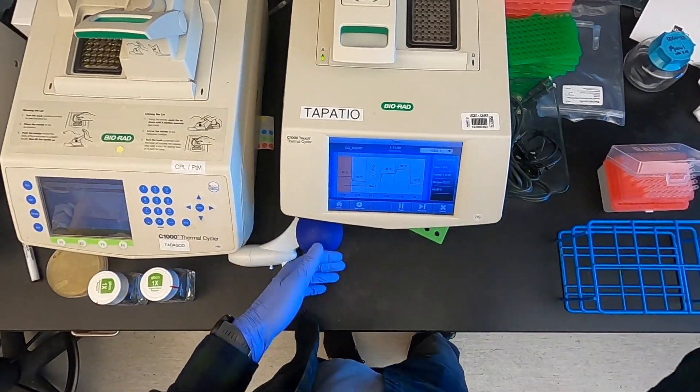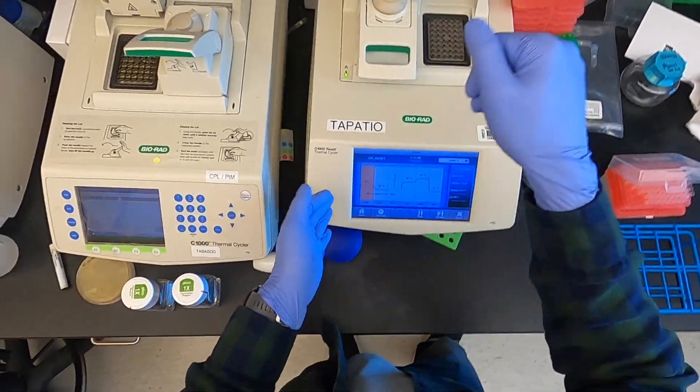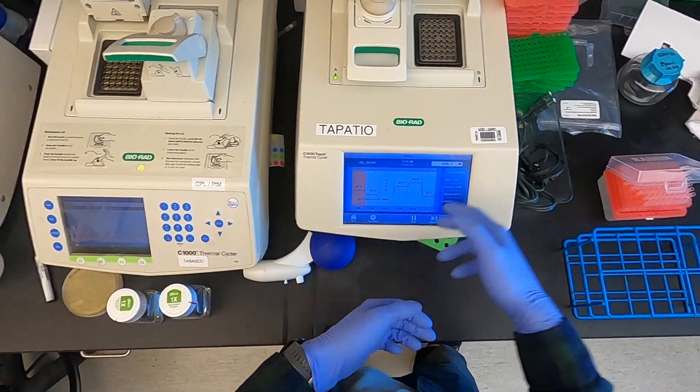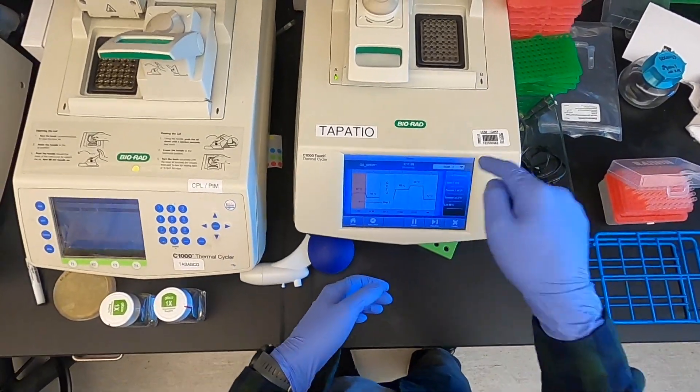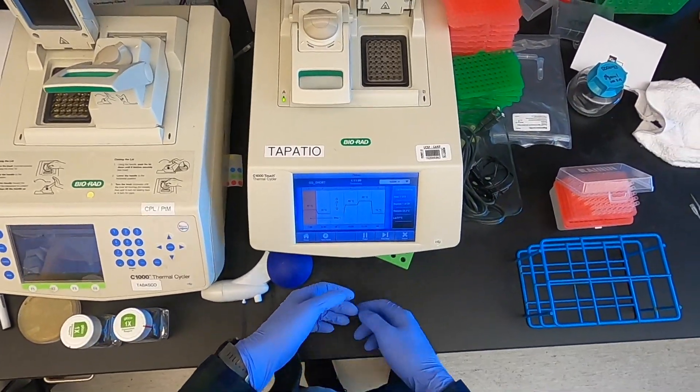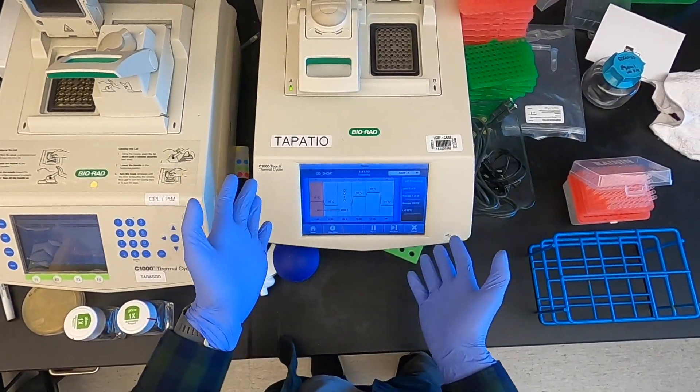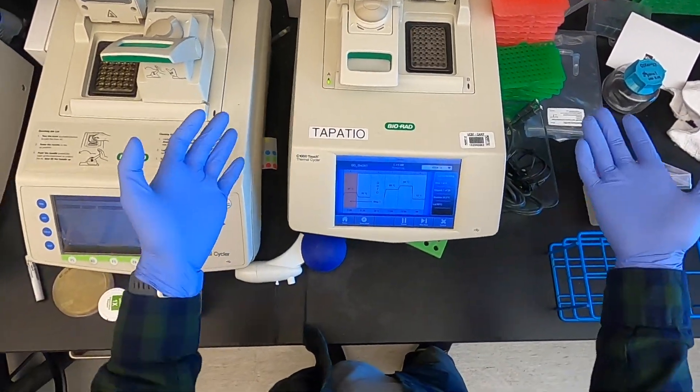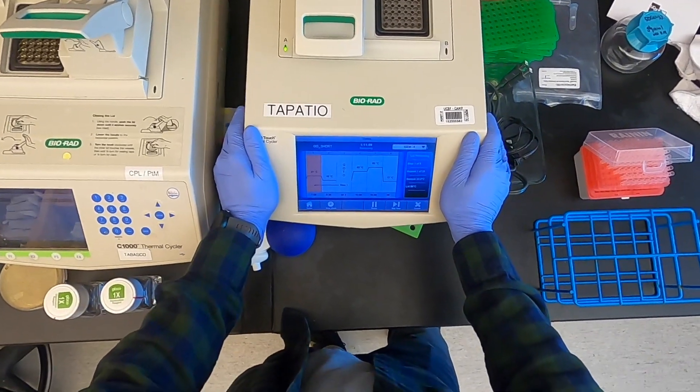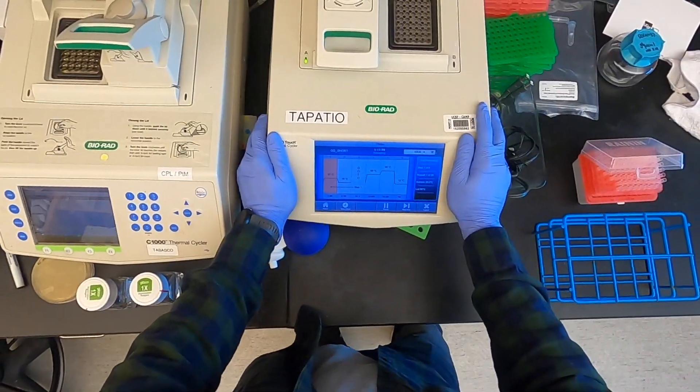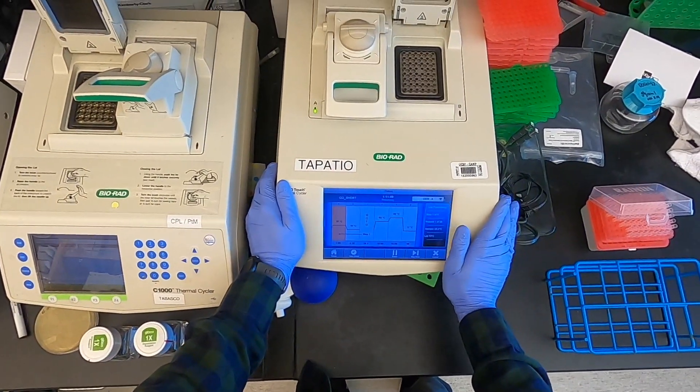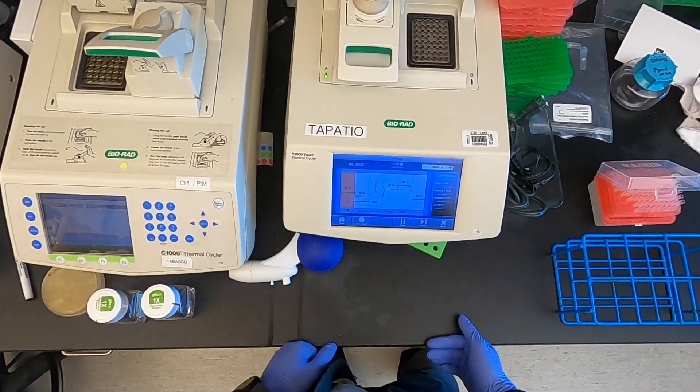This has happened to everyone and still happens to me sometimes where you put your tubes in the thermocycler, you select a protocol, hit run, and you just forget to select and confirm that volume before walking away. Then you'll come back expecting your run to be done and it won't be and you'll be sad. So yeah, just always make sure you get to that screen before walking away. And that's it. That's how you do a Golden Gate assembly.